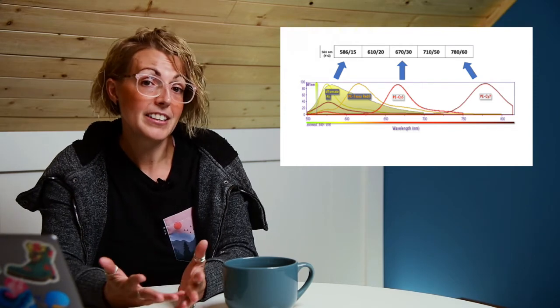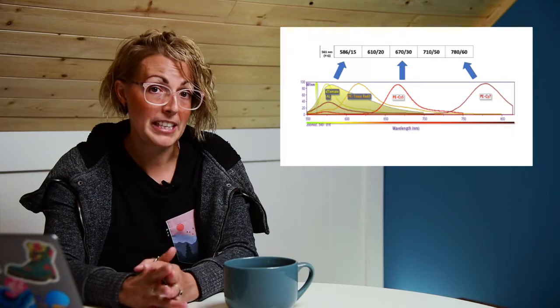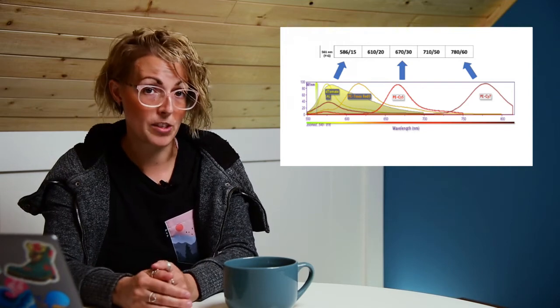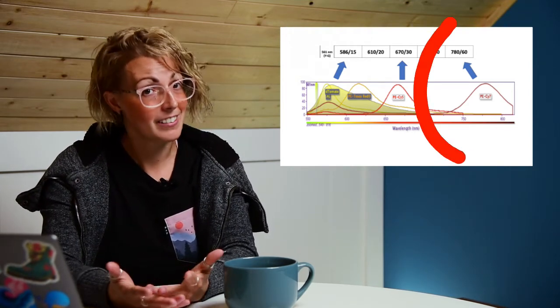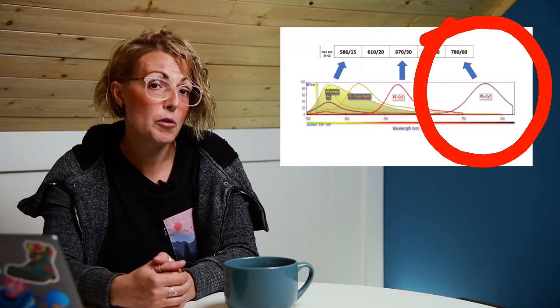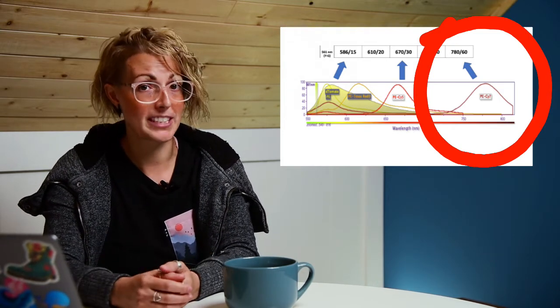Now, moving down this laser line, there are another few bright options, most notably PE-Cy5 or PE-Cy7. So if we want to spread out our fluorochromes the furthest, which would make more sense? If you selected PE-Cy7, that's great, because PE-Cy7 is further away from PE, so there will be less overlap between the emission spectra of these 2 fluorochromes, and therefore less compensation.